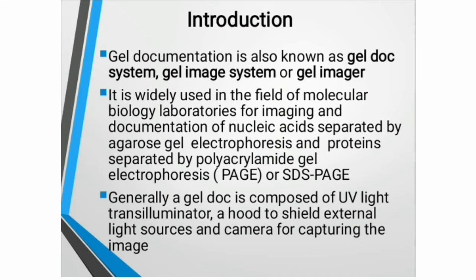Introduction. Gel documentation is also known as GelDoc system, gel image system or gel imager. It is widely used in molecular biology laboratories for imaging and documentation of nucleic acids separated by agarose gel electrophoresis and proteins separated by polyacrylamide gel electrophoresis or SDS-PAGE.